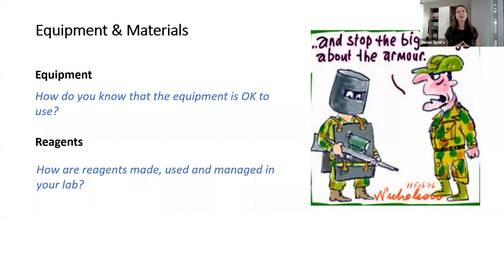Pipetting has to be one of the worst for us at the centre. We get lots of submissions that say they've submitted plates with a uniform 50 microliters in the plate, and the volume is super varied. So clearly there are problems with pipetting. I've seen it in laboratories when you look through the window. People pipet like this. They don't even look. They don't even check that the pipette is actually picking up what it's meant to, and that they've fully dispensed. So these are really easily fixed issues.